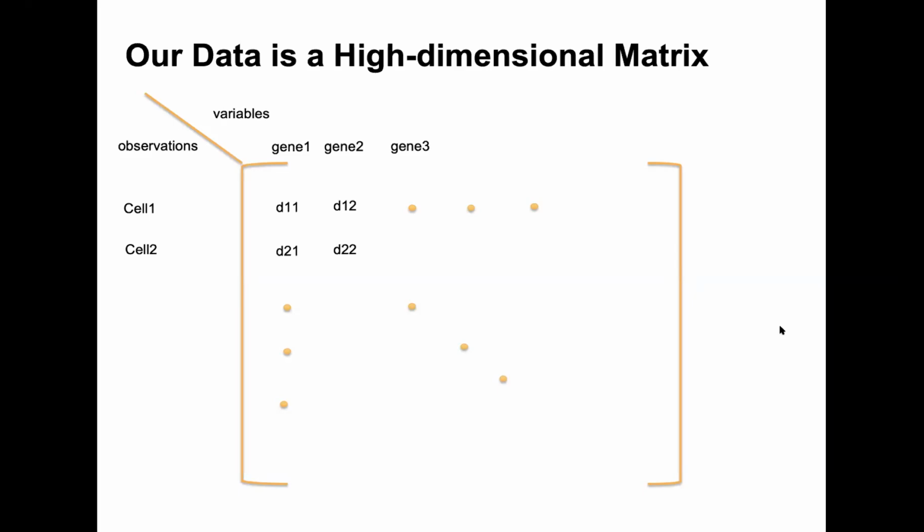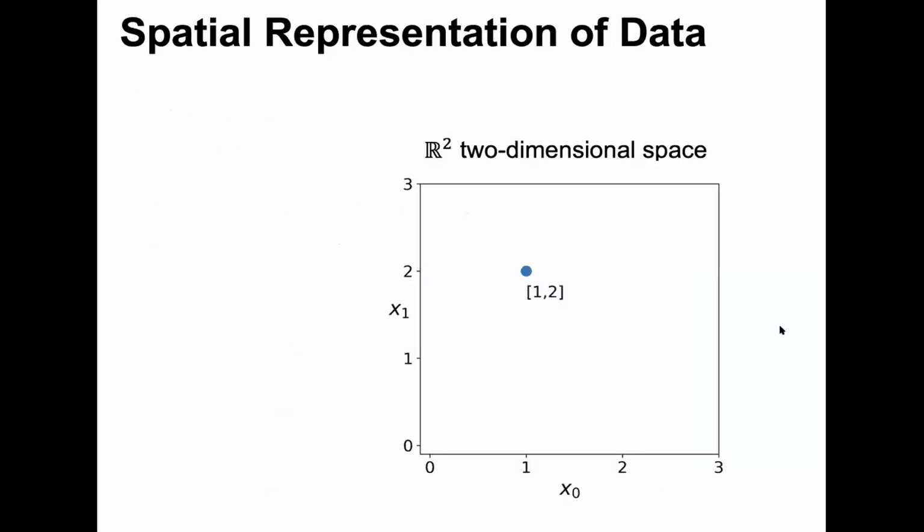It's important to remember that a lot of the methods that we cover are more sensitive to how many cells there are, not so much how many genes or features there are. There's a specific reason for that, and you'll see it in a second. When we turn this into a cell-by-cell graph, it will become very apparent that the number of cells, in a sense, controls the runtime and complexity of some of the methods that we go over.